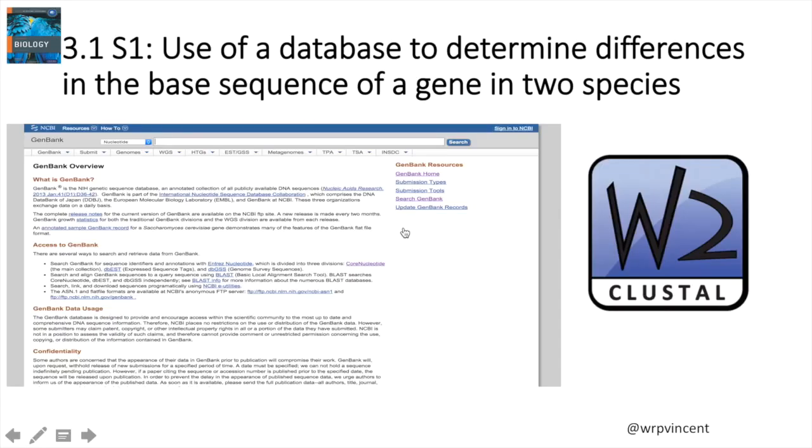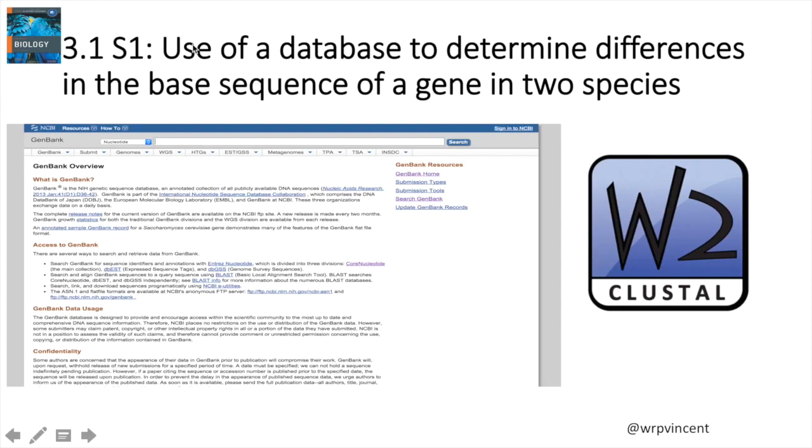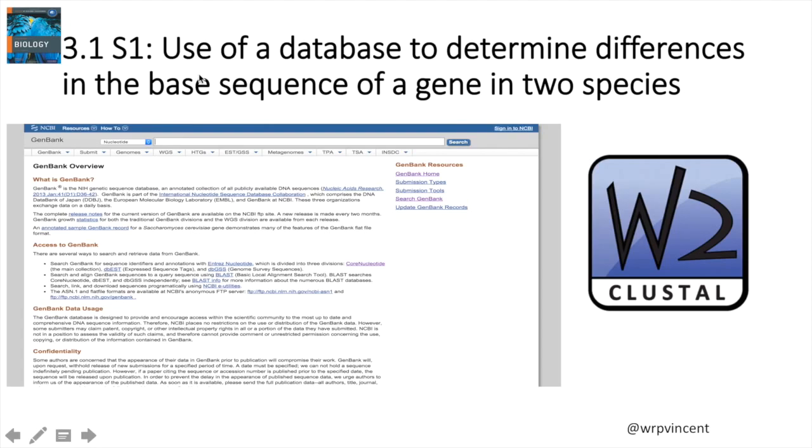Hello there. In this first database activity for topic three, we're going to be looking at the skill, the assessment statement for 3.1. Skill one is use of a database to determine differences in the base sequence of a gene in two species. In this activity, I'm going to show you how you can use some information online to actually complete this task.